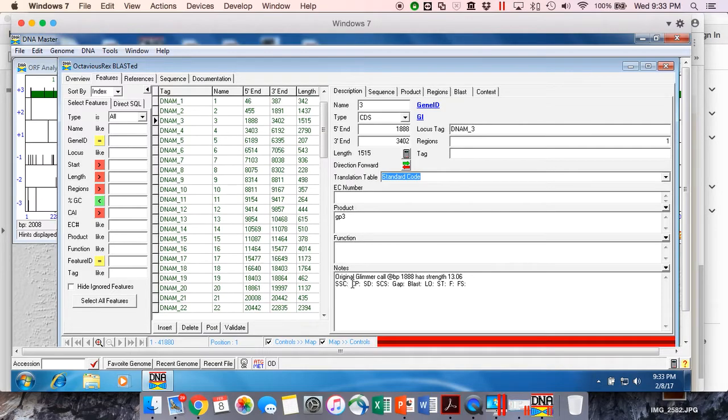So you want to open your annotation guide to page 76. And this walks through the way in which we want to enter our data. So on page 76, you can see the first is SSC.